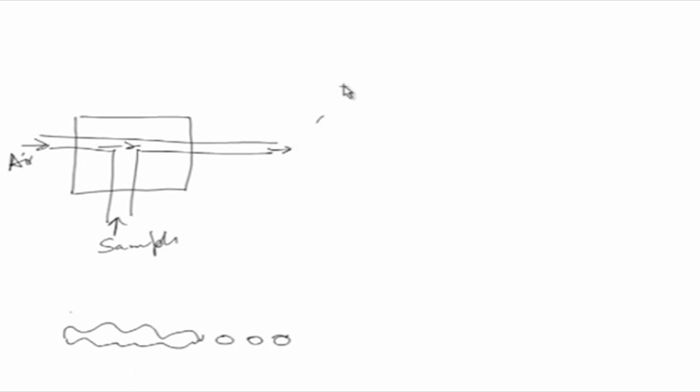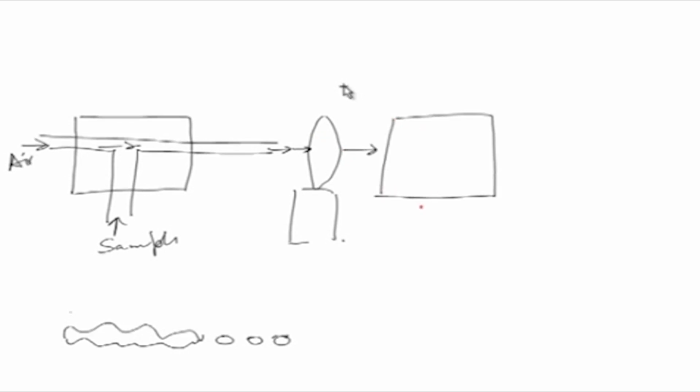Once it is in here, there is a flame at a particular right part of the flame, and the flame is set with laminar flow so that it is properly oriented. Then the sample is introduced into the flame, where the excitation process and then emission occurs. This is then recorded and passed through a monochromator. The monochromator will allow only certain wavelengths to pass through. Then a detector is placed after the monochromator, and from the detector there will be a readout.